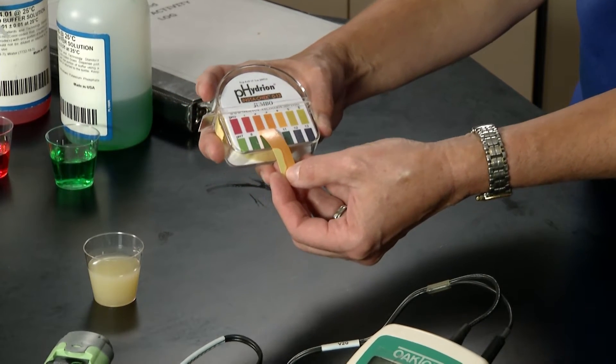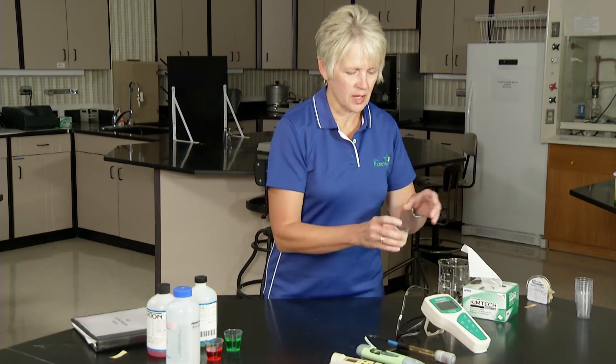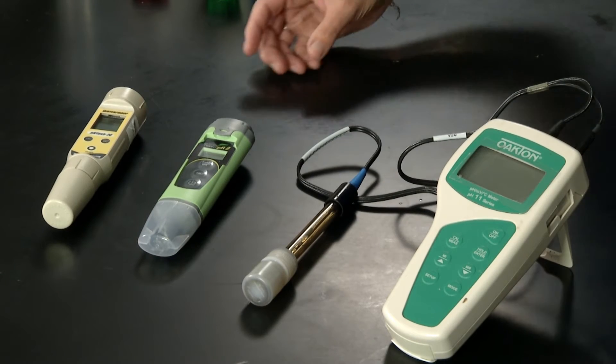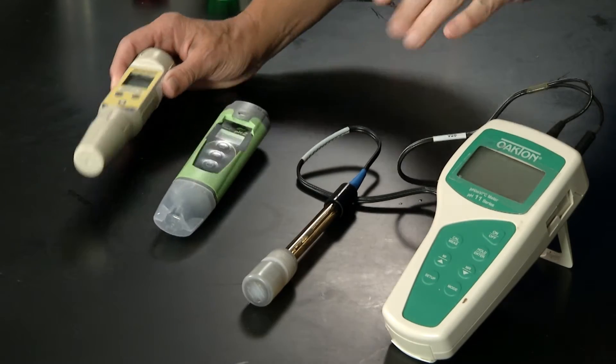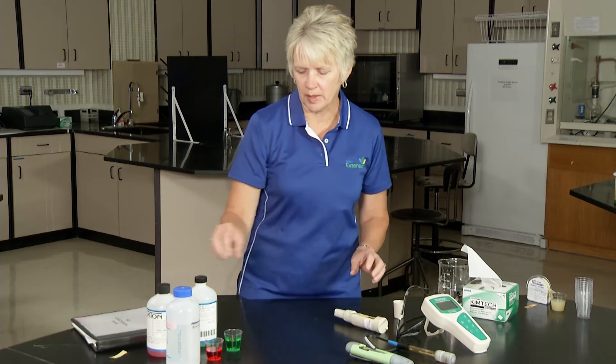So once again we don't have quite the accuracy. If we want to be more accurate we would use a meter such as this, particularly if we're working out in the field. These are very commonly used. These two are probably a little bit more user friendly than this one here. If you were doing research you'd have a real fancy high-sensitivity bench top meter.